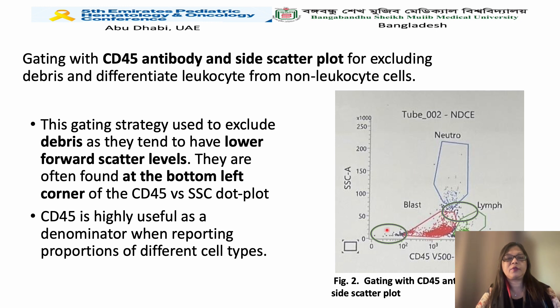This plot shows CD45 versus side scatter. The CD45 antibody is useful for excluding debris and differentiating different types of leukocytes, which are grouped into granulocytes, monocytes, and lymphocytes. Green dots indicate lymphocytes, red dots indicate the blast window, and there are separate areas for monocytes and neutrophils. The lower left area represents debris, which includes large stars, platelets, and other particles.